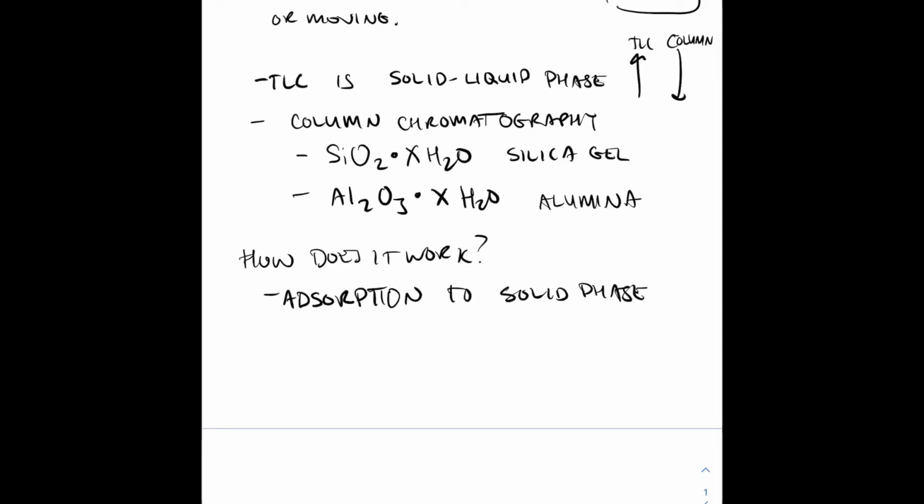How is it going to adsorb to that solid phase? It's going to do that using intermolecular forces such as London dispersion forces or van der Waals forces, and the dipole.